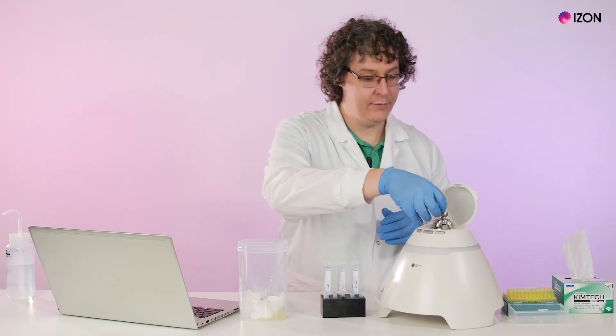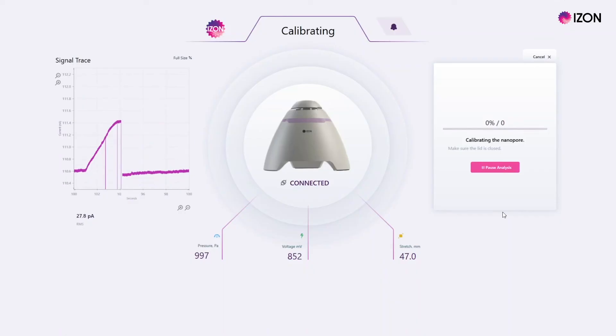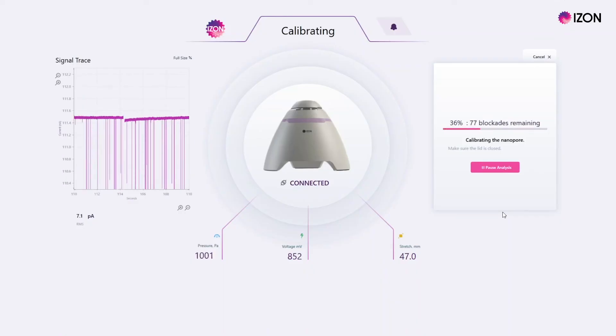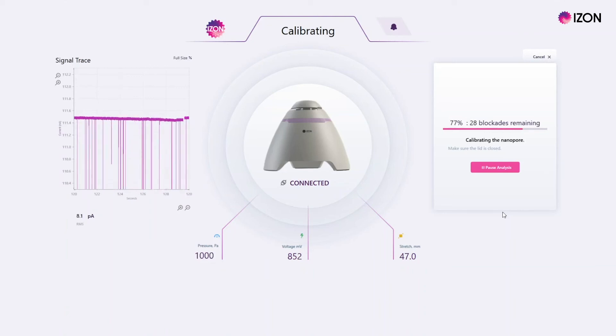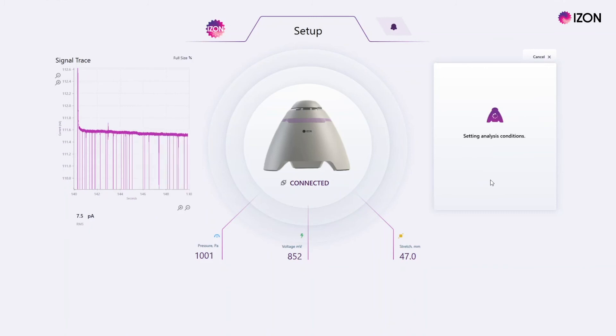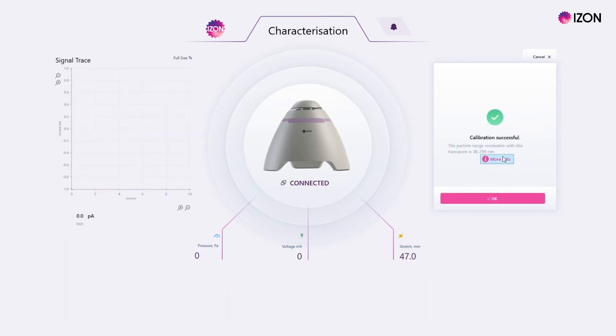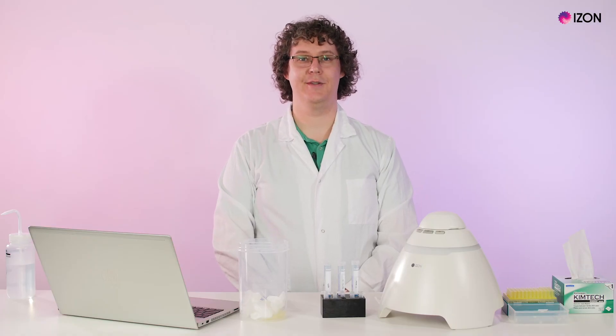Insert the pressure nozzle, close the lid, and press start. Wait for 100 blockades to be measured. The software will then display the particle size range of this nanopore — this is the full range that the pore can measure across different stretches, from 45 millimetres to 49 millimetres. Click done to finish the nanopore setup process.